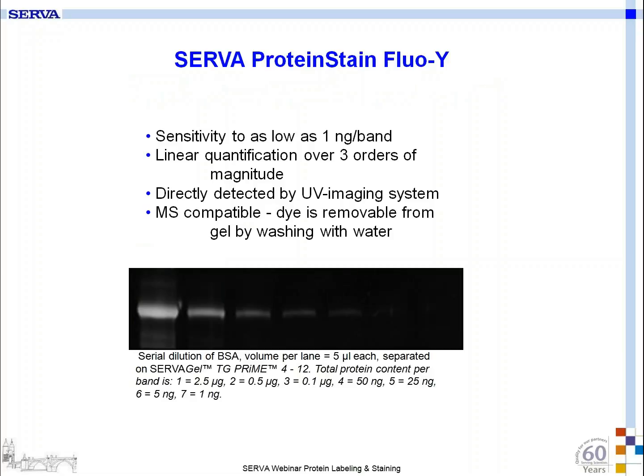It has a sensitivity nearly to 1 nanogram per band. It's linear quantification over 3 orders of magnitude. It's directly detected by a UV table or light source.